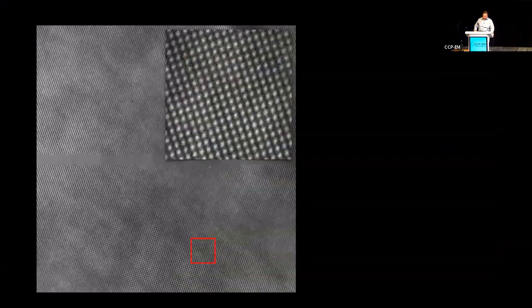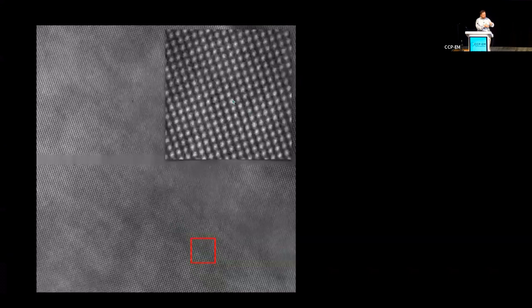But we did put in one more little sort of lump of metal, as it were. So this is a micrograph of gold, 200, where it's been oriented along the viewing axis. You can see now the gap in the detector here, but it's been filled in by just some gray levels by Greg's nice software. And so if you zoom in on a particular region, you can very nicely see the atomic columns in the lump of gold. And this was to get the attention of the microscope manufacturers that this is a pathology grade microscope. This thing is what you would sell to the NHS to put in their lab to look at plastic sections that could diagnose kidney disease or something. But you can see atoms with it, right? And that certainly wouldn't be the case if we hadn't made these modifications.